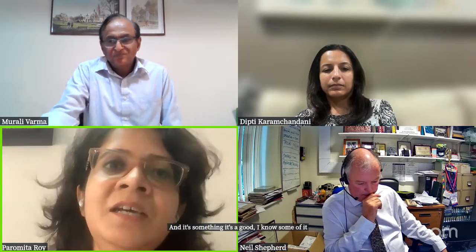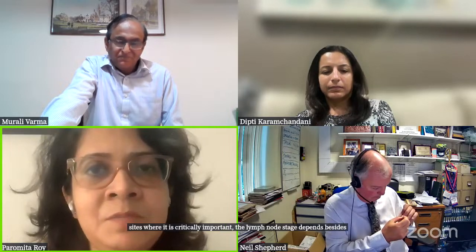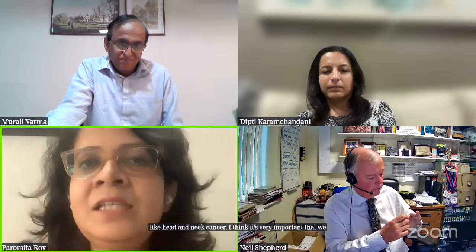I know some of it is redundant, but for case sites where it is critically important, where the lymph node stage depends on it, besides the adjuvant treatment, like head and neck cancer, I think it's very important that we submit the entire node. Sure. And it's good to have one standard practice.